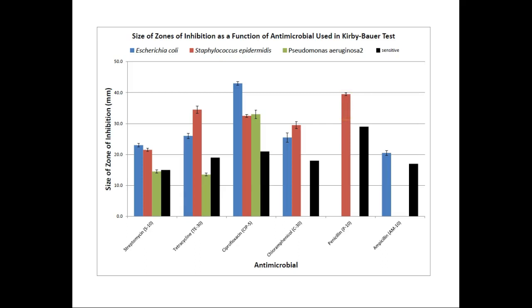All right, and what do we know about penicillin? Interferes with cell wall synthesis, specifically peptidoglycan. Who's got the thick cell wall? Gram-positive, right? Our staph. This is what we expect. Gram-negatives, for the most part, are resistant to normal penicillin. It can't get in past that outer membrane. Not that they don't have peptidoglycan, which some don't, but it can't get in the cell because of that outer membrane.